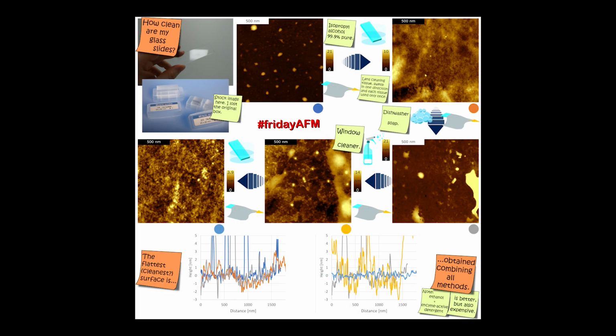Some of you might remember that this is not the first time we image glass in Friday AFM. Some time ago, we looked at how different cleaning processes affect glass. We got glass slides, which I cleaned with alcohol, with dishwasher, and also with a window cleaner. From all these processes, I was not very satisfied because all of them leave residues. But I came to the conclusion that by combining all of them, sometimes you might get a decent result.